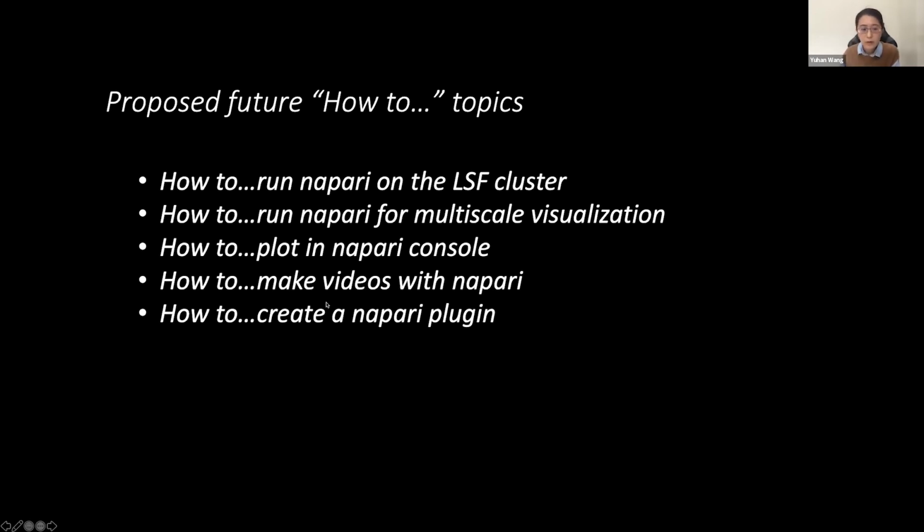And also, I think there are some threads on making beautiful videos with Napari, but my experience with this was it's pretty slow for me, so it would be nice to learn more on how we could make videos with Napari for presentations. And lastly, how can we create a Napari plugin in this case?